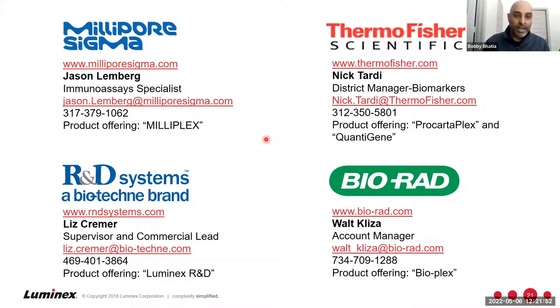Did you want to comment on anything about the four companies? Sure. We have used kits from all four of these, and they all work. Some of them have slightly different setups, which allows you to run fewer or maybe more samples per 96 well plate. But I can say that all the kits work as they were promised to do. So I think all four companies make a good product.